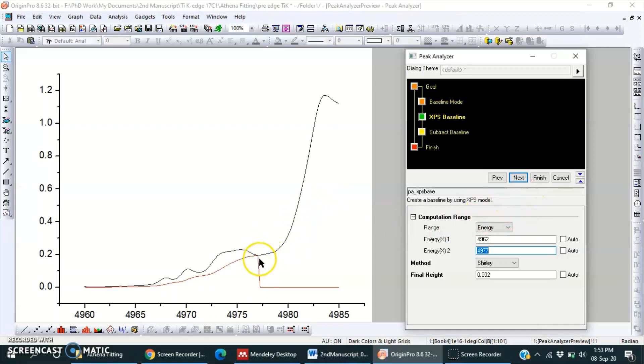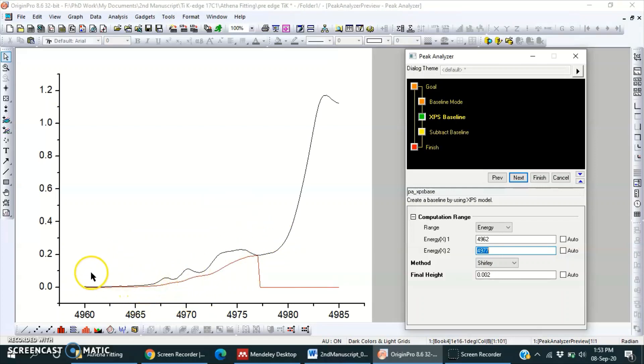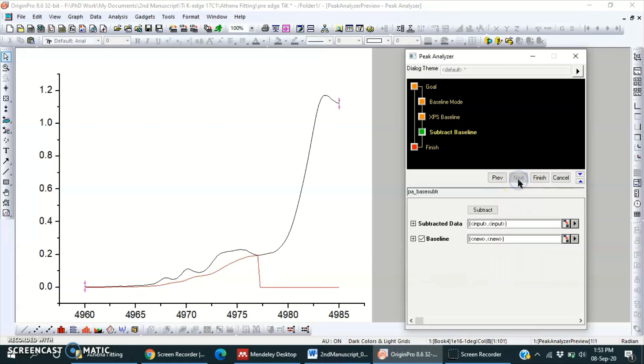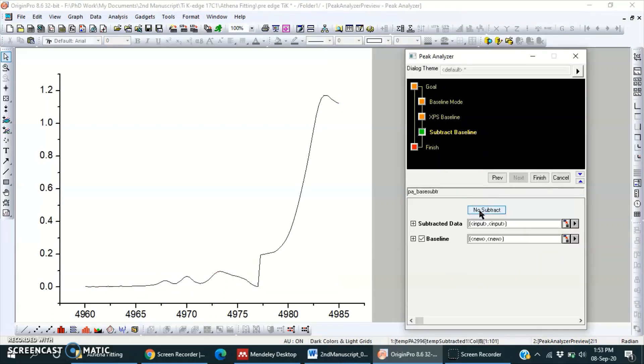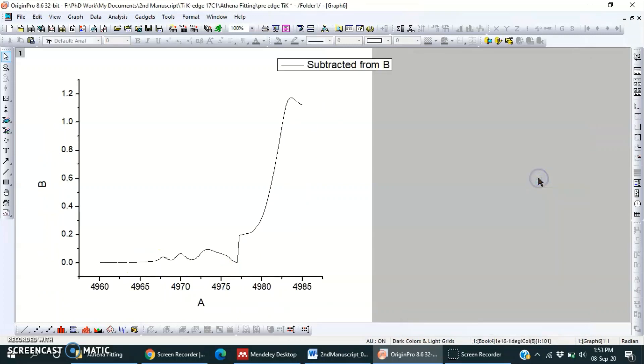We should not worry about this region because we are just going to fit only this region. So here it seems that it will not be a straight line, so another best one we have to choose after this one. So just subtract this baseline.